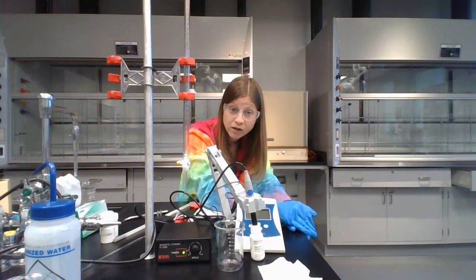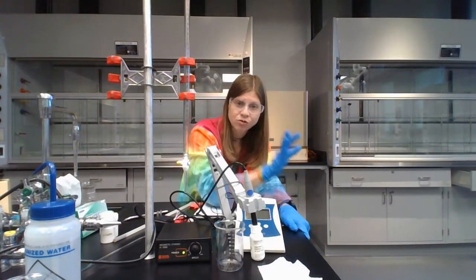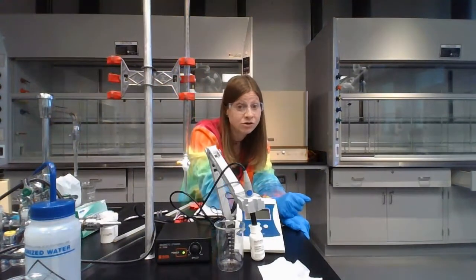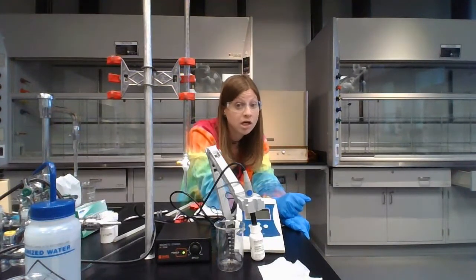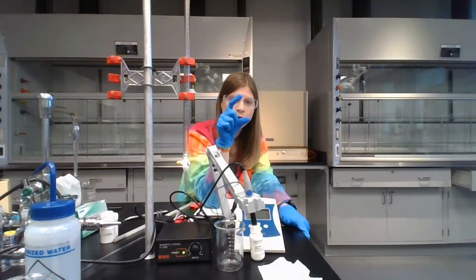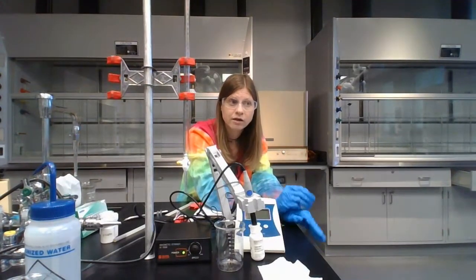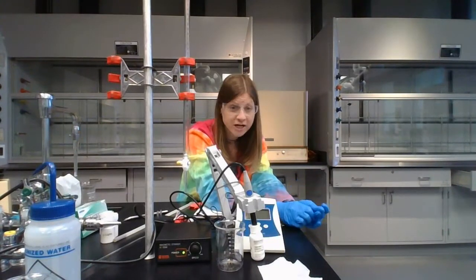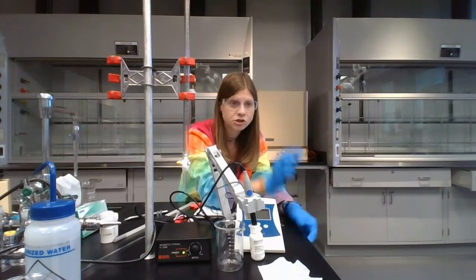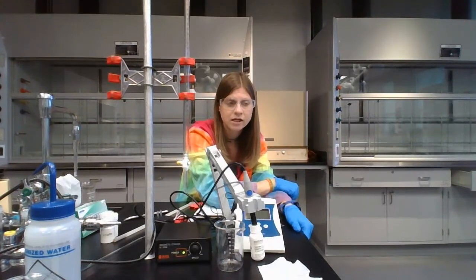One of them is the equivalence point, where the big jump happens, and the second one is this half equivalence point, which happens between 0 and your equivalence point. So don't jump down. You're not saving yourself time. You're screwing yourself over. So in trial 2, within that 0.1 milliliter range, you will see your biggest jump. Now, it's not going to be as dramatic because we're not adding 1 milliliter, we're adding 0.1. But the biggest jump within that small range is going to be where your equivalence point happens in trial 2.